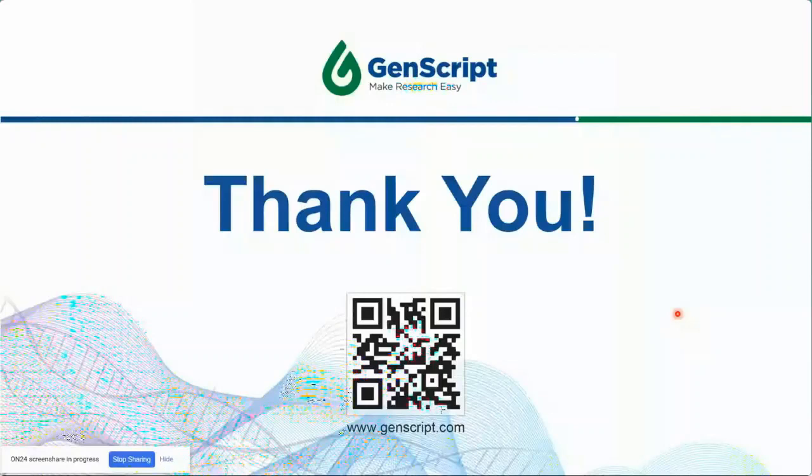Okay, thanks, Dr. John. So the next question: how specific is the antibody recovery from EasyOS, and also how pure will that be? Since each of the incubations is done separately, when it's recovered, it's going to be similar to the solution that you put into the system. Of course, because there might be residual washing buffer from the steps before, you might get a slightly larger volume, a little bit of dilution, but that's usually not a concern.